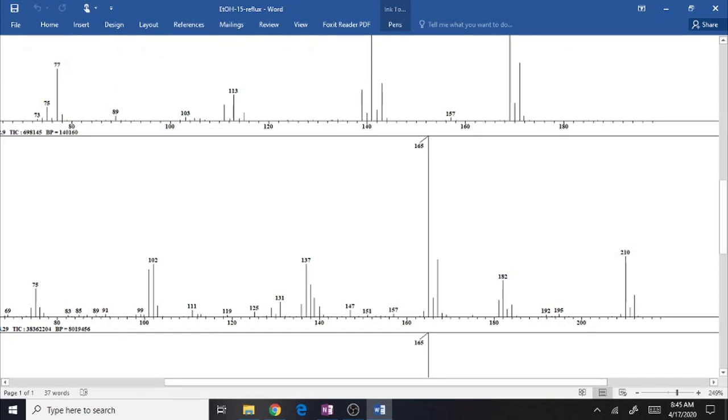All right, this mass spectrum should look familiar to you. This is the product you made, and again we see this M and M plus 2 indicating that whatever this is, it has chlorine. And again we see the M and M plus 2 here. But you should also be able to look at the difference between the masses of these two peaks, for example 210 and 182, and recognize this as a loss of 28.